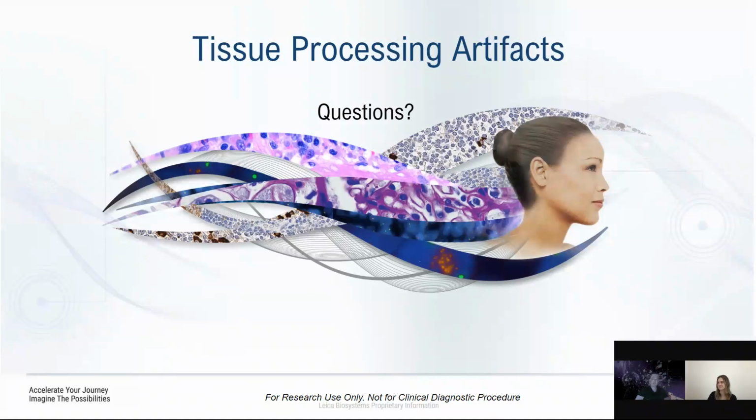If you're doing studies with brain, which is a lot of the research out there, you're going to make those sections a little thicker. I've seen sections all the way up to 8 microns. So it just depends what you're targeting. Hope that helps. Perfect. All right.